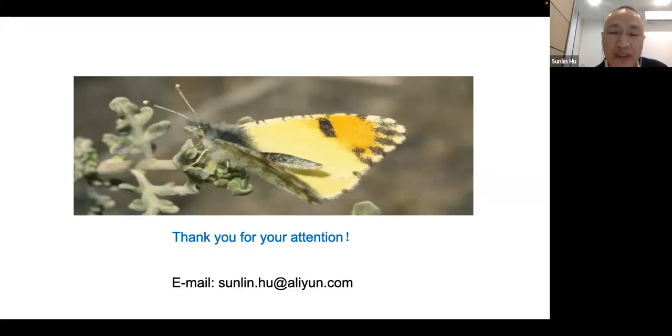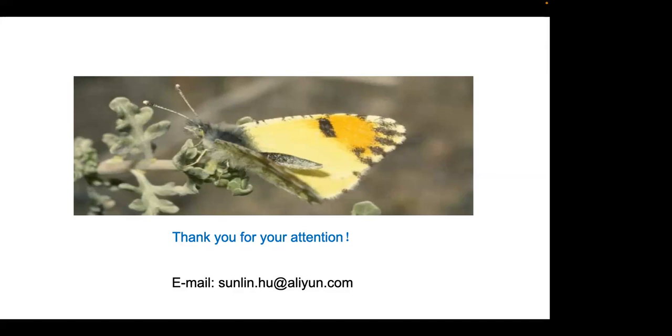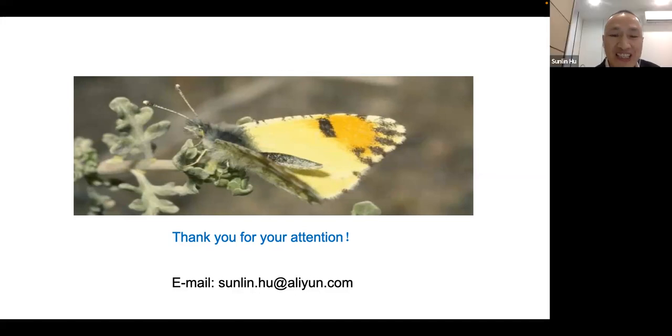And often we just identify a diatom at the level of genus, general. So the most important character we use is diatom morphology.